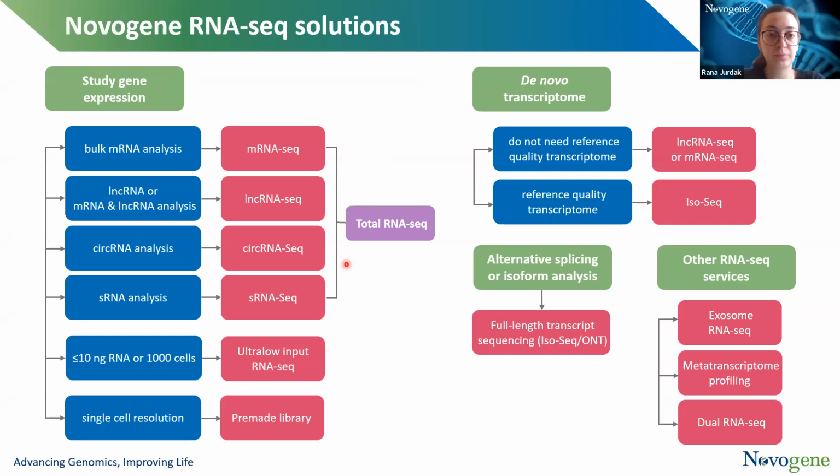Thank you for your answer. We have an additional question from Jade, who is asking if we can do metatranscriptome profiling on RNA-seq reads that have been taken from microbial culture. Just to give you a little bit more detail, they already have RNA-seq data from bacterial monocultures and co-cultures to look at the microbe interaction.